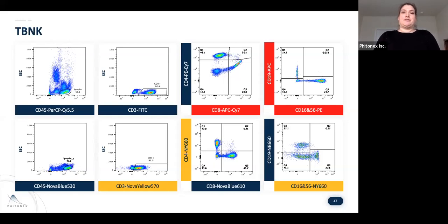Any steric hindrance have we noticed? Really we haven't run into that yet. I think the place where we're curious about it is looking in the intracellular space. So that's one of the open questions. That's one of the things I'm actually in process of trying to do. It's just a matter of getting the antibody conjugated and running the test. But these are actually all the size of fluors you've been normally using, so there's no real problem that we've run into at this point.